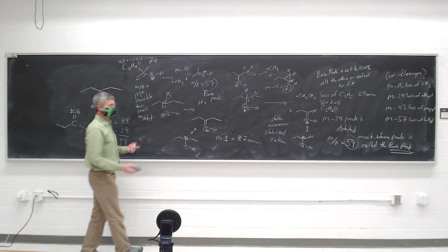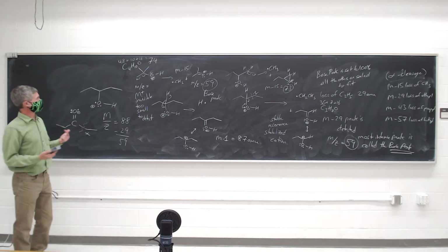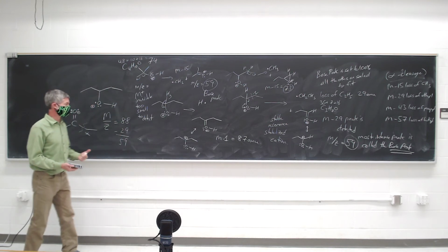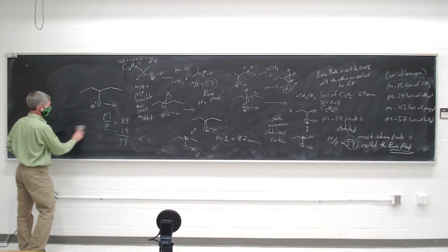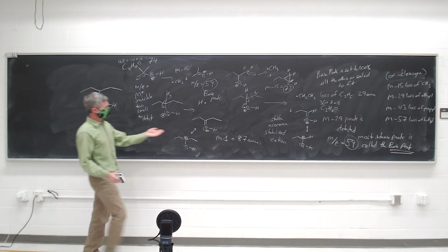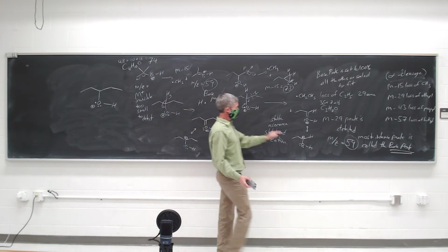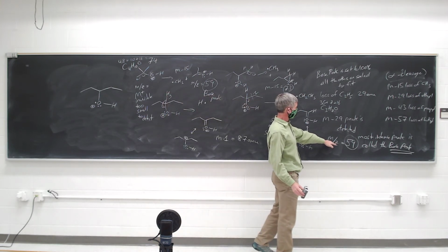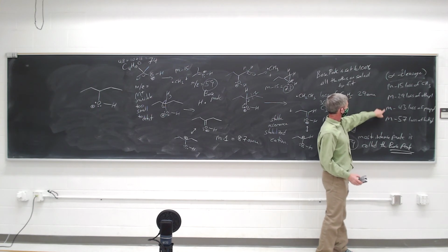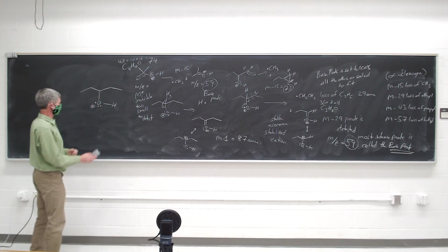It's annoying when your molecular ion is not visible, but sometimes you can explain readily why it's not visible, just because the fragmentation is so rapid. So for this molecule, this M over Z 88, we'd expect to see some at 87, right? But the hydrogen radical is not that stable. We'd expect to see quite a lot of 59 for loss of the ethyl group. We really don't expect to see a lot of M minus 15. We shouldn't see any of this because there's no good fragmentation pathway to those.